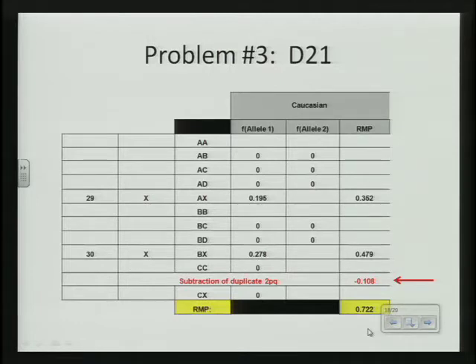Even though 281, the 30 allele at 281 is above your stochastic threshold, again, that stochastic threshold is based on a single source sample. So based on peak height sharing, let's say you have a 1-to-1-ish type mixture, or maybe a little bit more than that. You can take a portion of that 29 that can actually pair. I mean, that could actually pair with something all the way up to 300-ish.